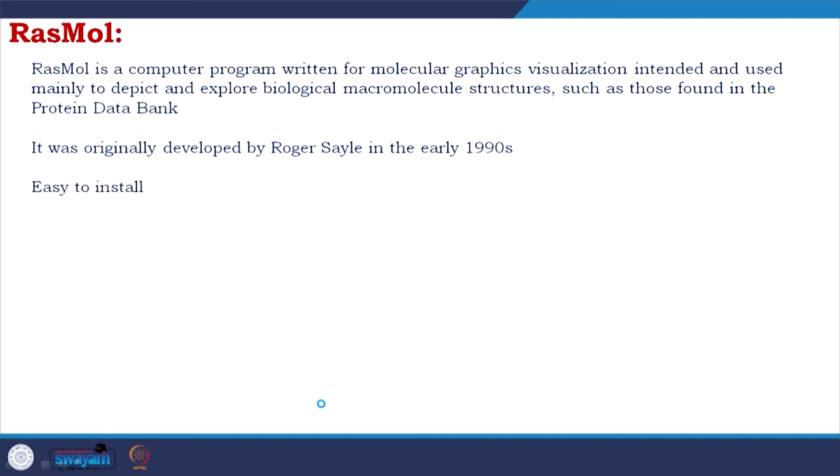RasMol got popularity because it is easy to install and widely used. More than 1 million people at that time used RasMol for structure, presentation and publication.